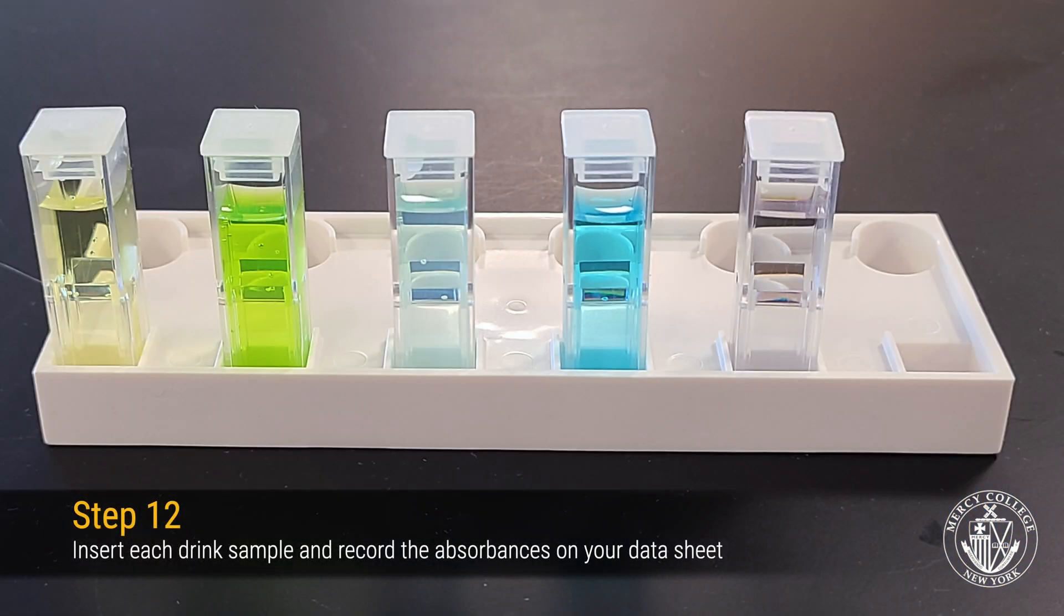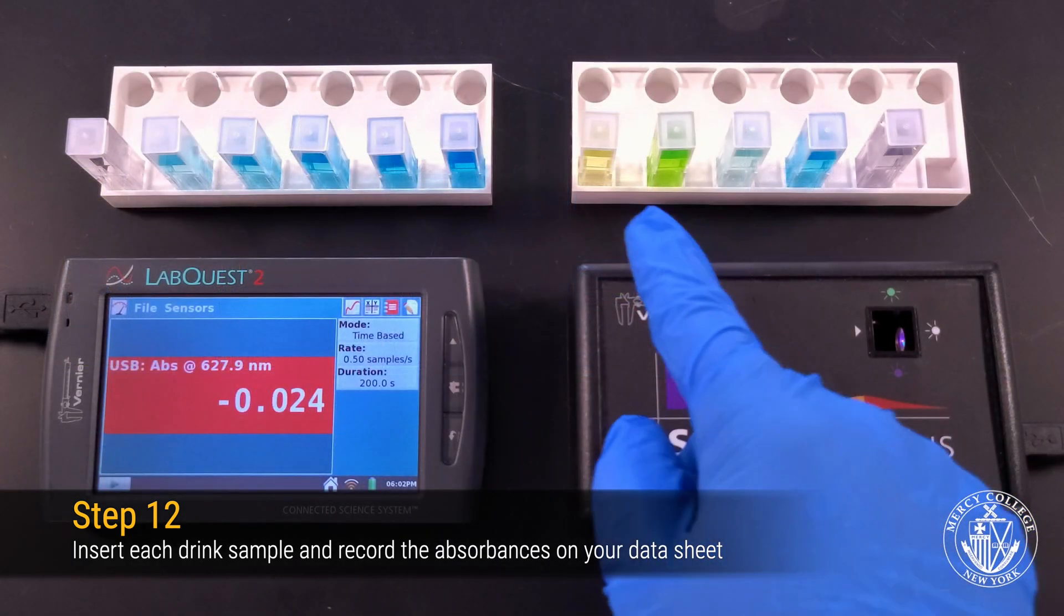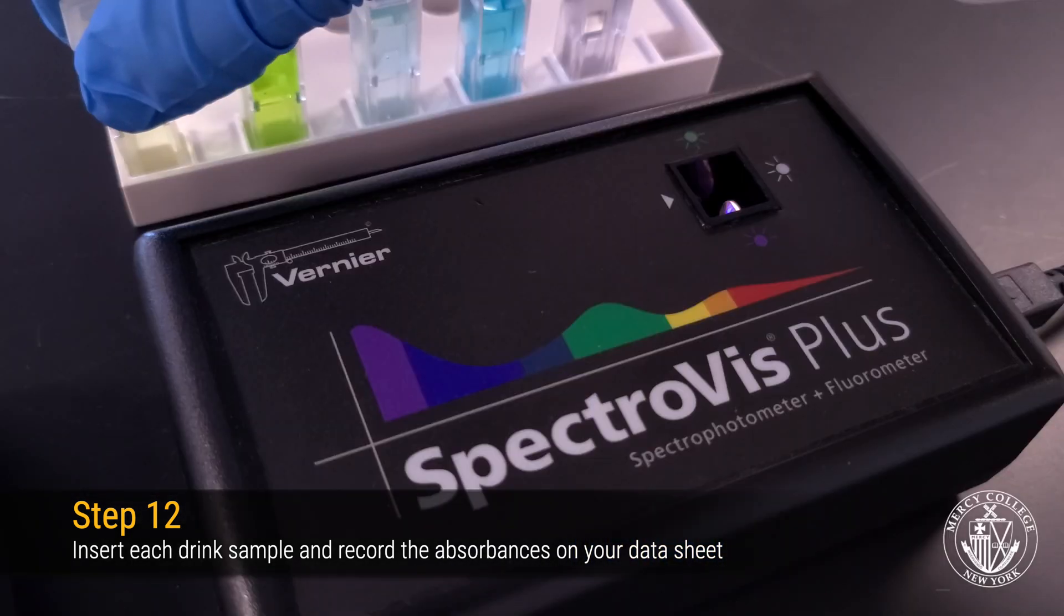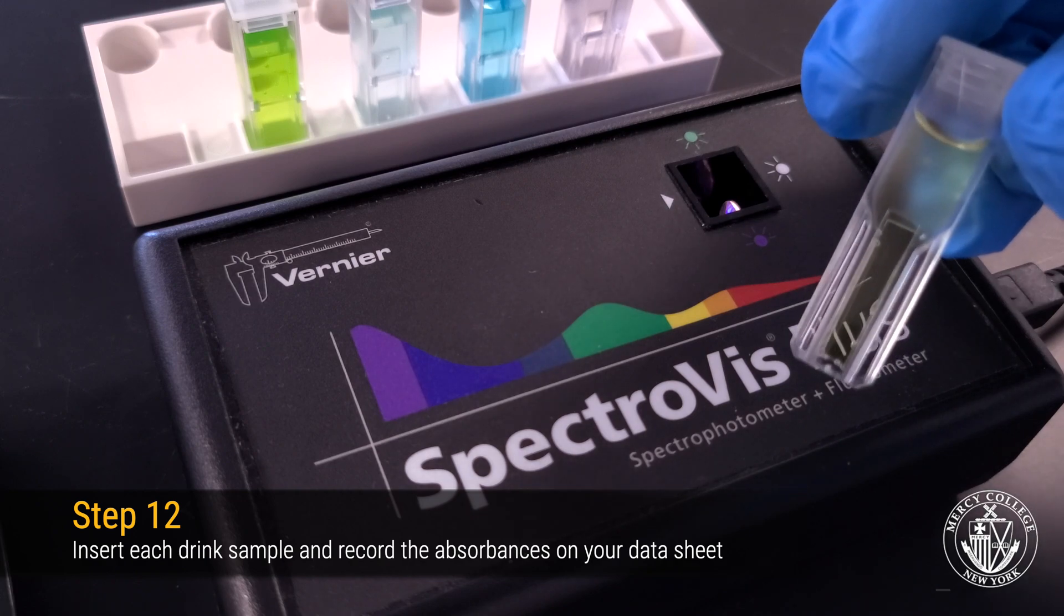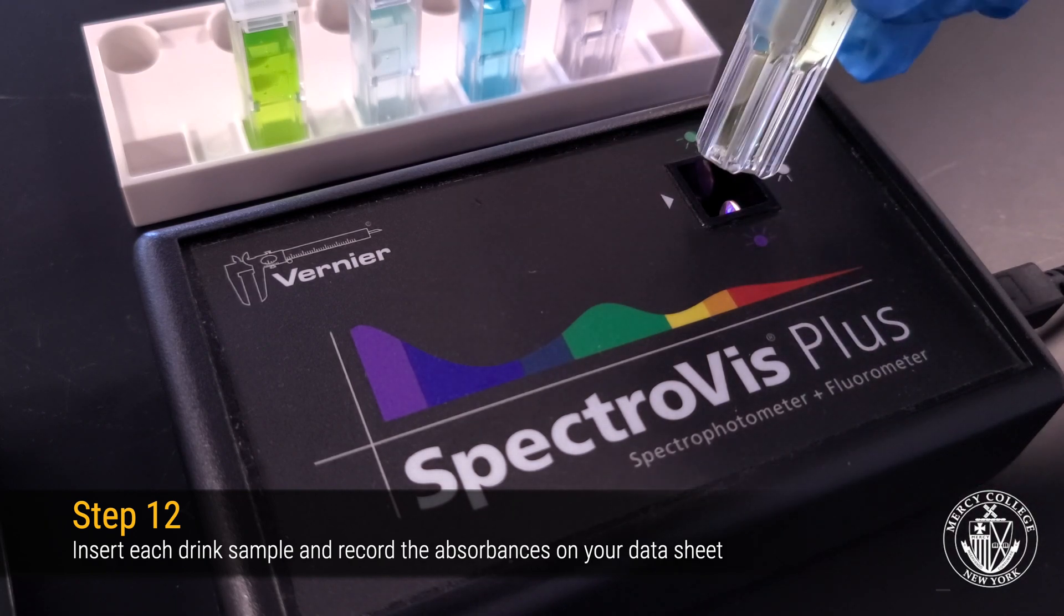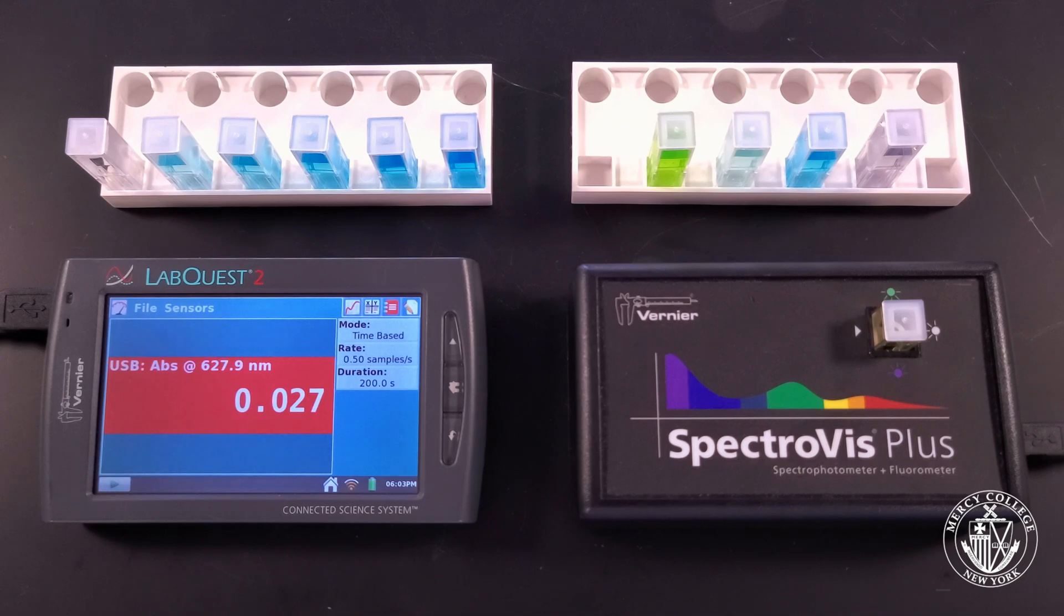We're now ready to analyze our sports drink samples. We'll again insert the sample cuvettes into the spectrophotometer one by one, making sure that the arrows on the cuvettes line up with the arrow on the spectrophotometer.